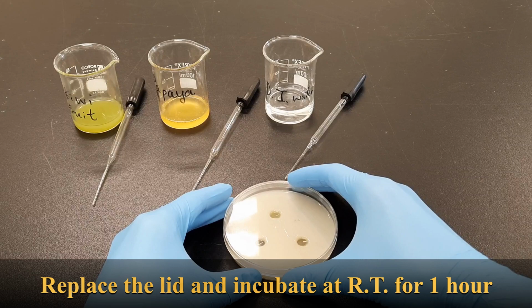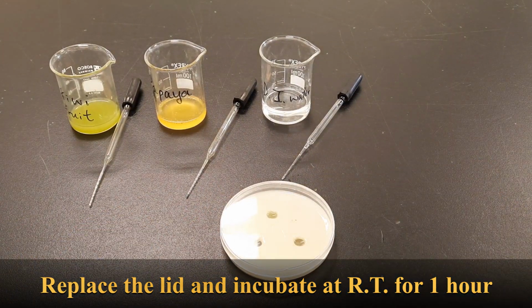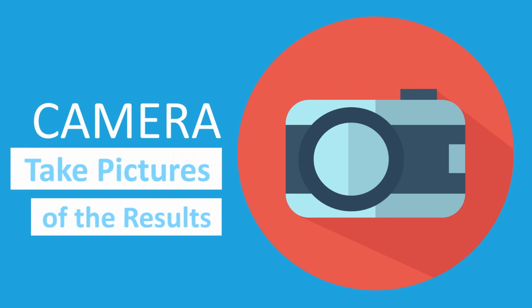Replace the lid and incubate at room temperature for 1 hour. Now we can use the camera to take the pictures of the result. Let's see the result.